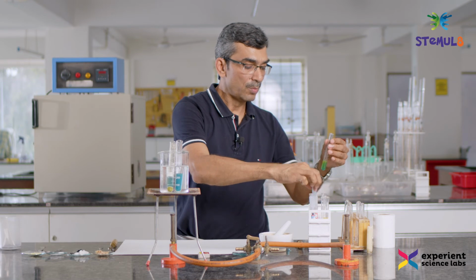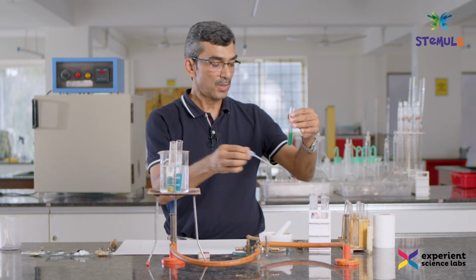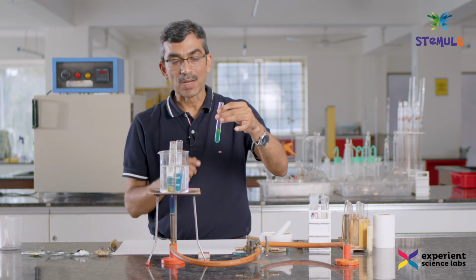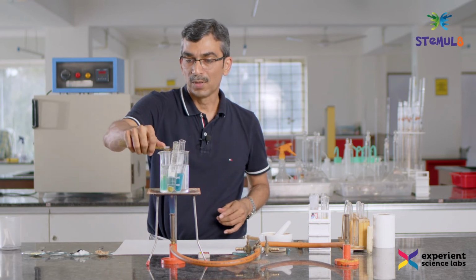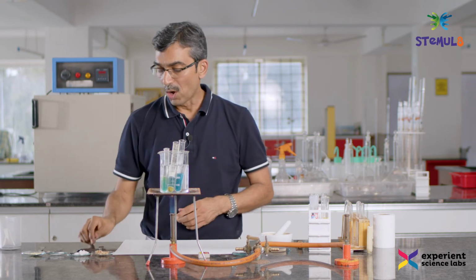So I will try to remove as much as possible the original color of it. It is still dark green, and that will be the starting point for us. For this one I will have to use tongs because it's a smaller test tube, but it should be doable. Yeah, okay.